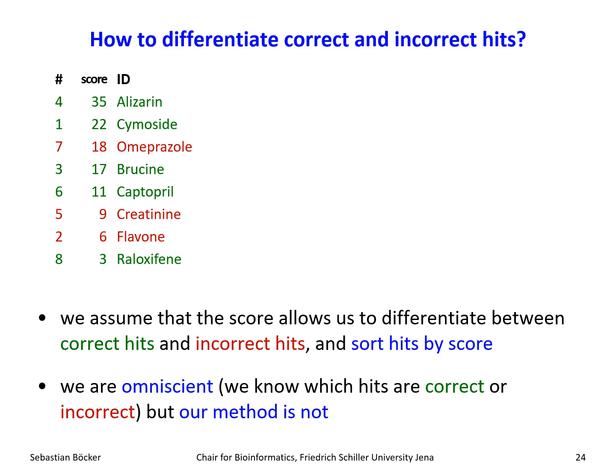So how can we compute exact FDR? As I said, we have to know everything to do that. We assume that we had some queries. For each query, we found the best scoring candidate. It gets a score. It doesn't matter if this is the CSI FingerID score or any other score. And then what we did was we sorted those hits by score, this time assuming that a high score is the best. It doesn't really matter.